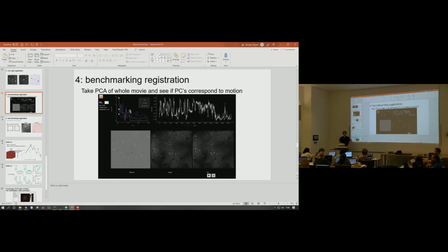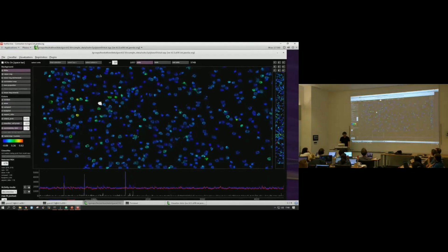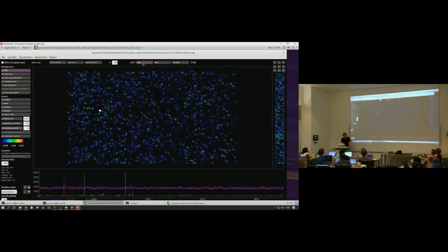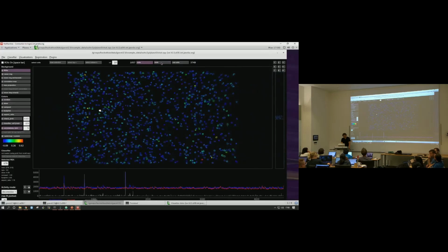Okay. Go ahead. So I have the select top and select bottom in gray. How do you activate those buttons? Yeah, sorry, so you have to be only in cells here. So in both view, you don't decide what you want, so that's why they're gray.